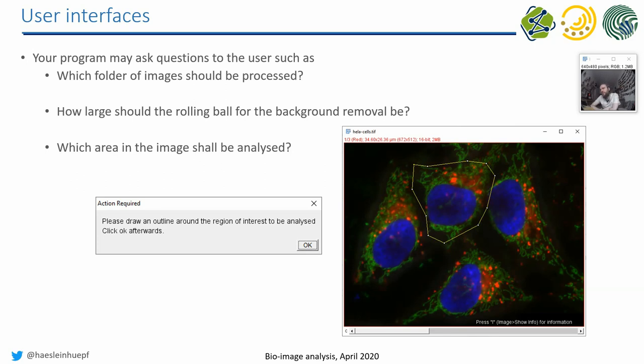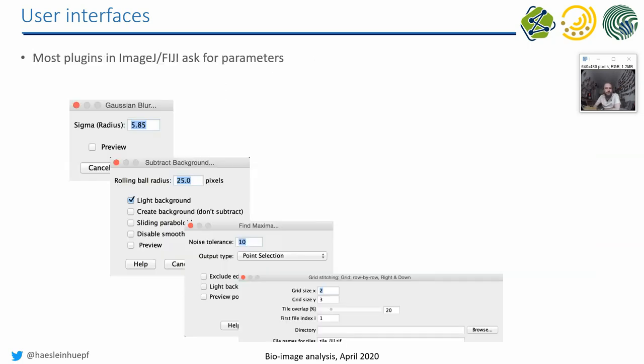So from time to time, you may want to write a script where you can ask the user for something. It can be outlines in an image, but it can also be numbers. And whenever you call a plug-in in ImageJ where a dialogue pops up, this is what I mean with user interfaces.